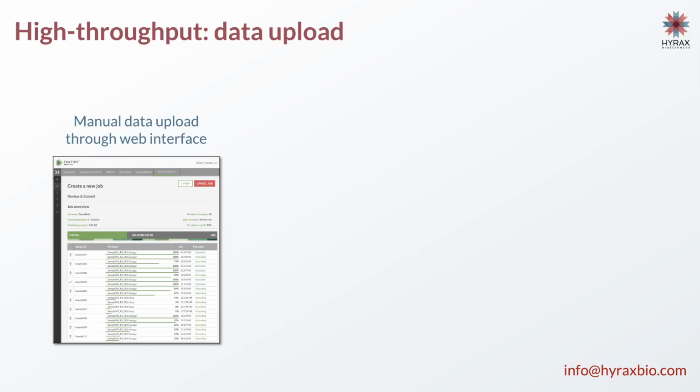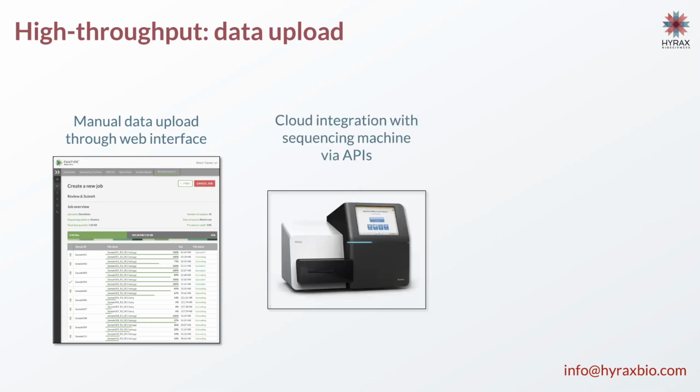That is how we've deployed the SARS-CoV-2 solution, but Exatype does have various other options for use. We have built APIs on the front end, which enables direct integration with sequencing machines. And I hinted at this earlier. We work with customers where once their sequencing machine produces the raw data, that can get pushed directly through to Exatype with no need for manual intervention. It just means that the data can be run automatically.